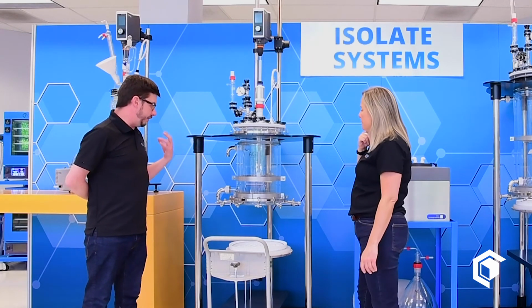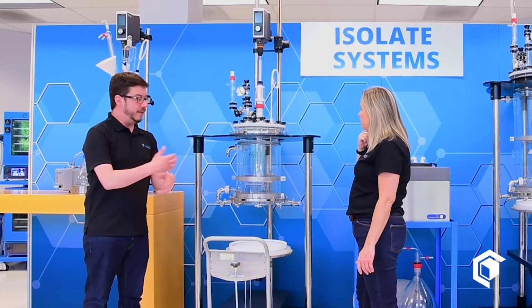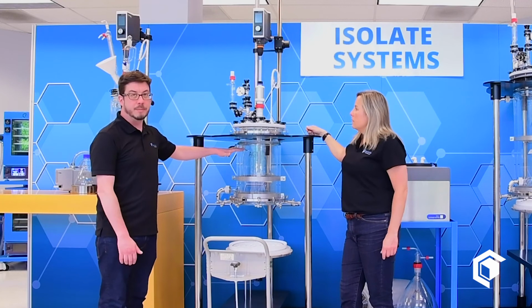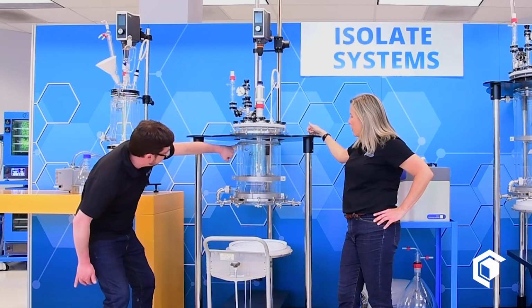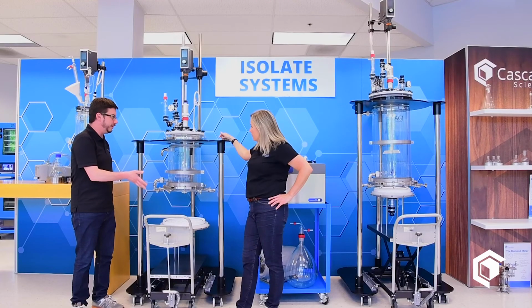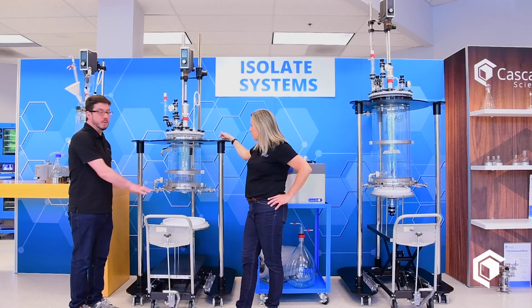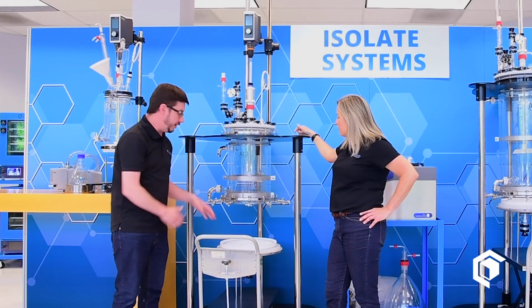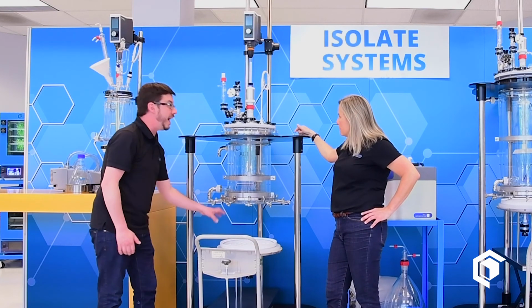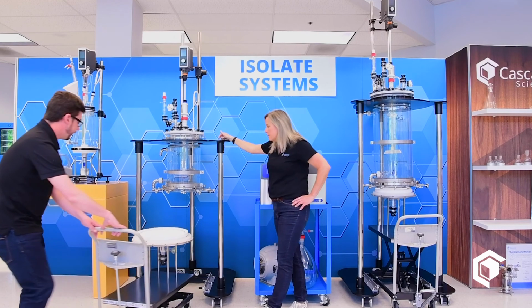Whereas some other processes you may need to remove the cake or scoop and scrape out the isolate and then rewash it in some sort of filtration system, I'm able to do that pretty much in process here through the spray ball valve located back here. It's a little hard to see, but there's a little PTFE downspout that comes down here. It's perforated, so it just sprays solvent on it, washes it down, washes discoloration out, the browns, the gunky looking color that's not this white, fine, powdered isolate, and pulls that out. And when that is all done, then we can remove our cake safely. Again, with this height and vessel configuration, we're afforded a lot more clearance in terms of how much isolate we can create. So when that would be done, I can just simply pull the cake out. Nice and easy.